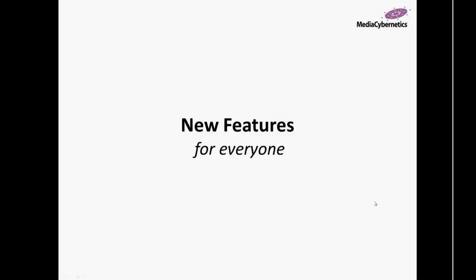Thank you, Jeff. Now what we want to talk about is a few additional features that are not specifically features that will be perfect for an individual, but more really catered to the entire group of users for Image Pro. I wanted to make sure that just in general, from version 9.0 to 9.1, there were significant improvements, that people noticed a difference in the software that they're upgrading to, and that there were improvements that made everyone's life a little bit easier and made it easier to customize the software for your needs.